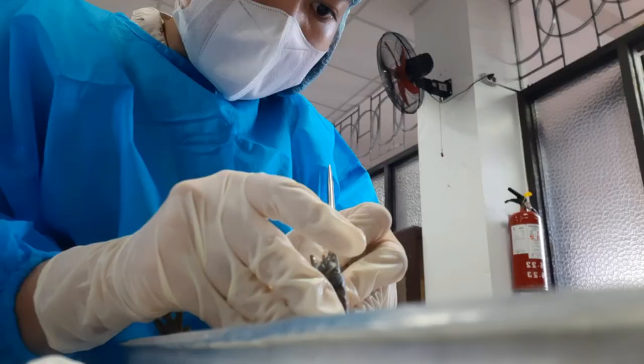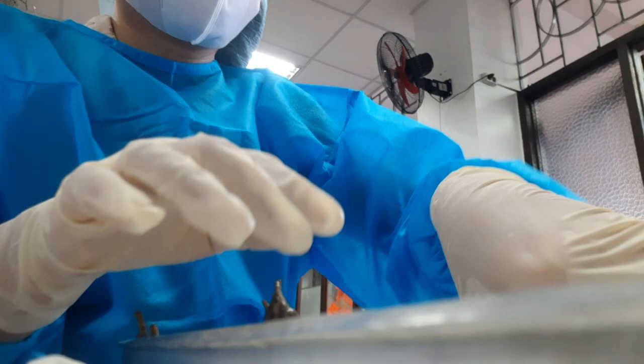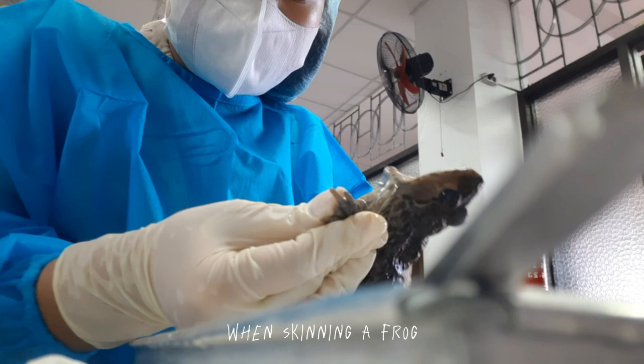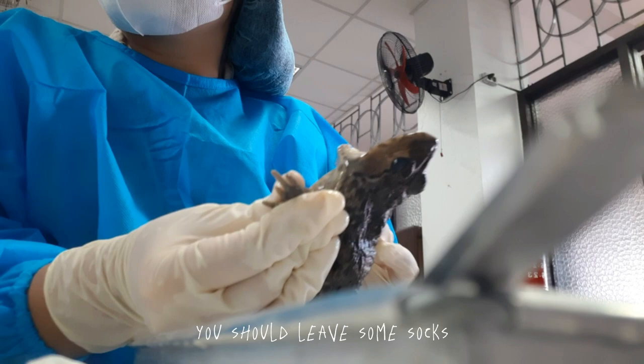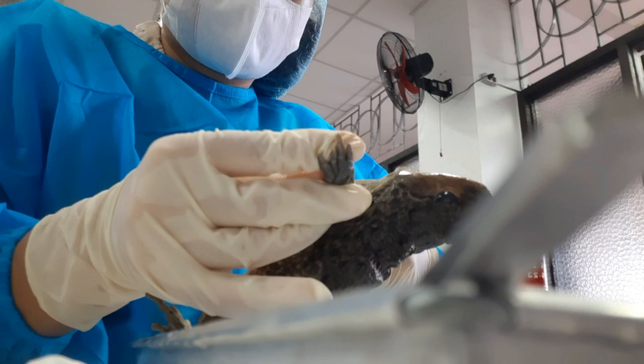And I'm going to start working on, you want to consider trying to go right down the center of the hind limb if you were to map it straight out. So like this. This gets the foot region. This is where I'm talking about, leave little socks on him. So think the top of your socks and how they go around. Once again, be very careful not to destroy the muscle tissue beneath the skin. You want to go just behind the heel to leave the socks on. Okay? So ito na siya, tapos si skin.